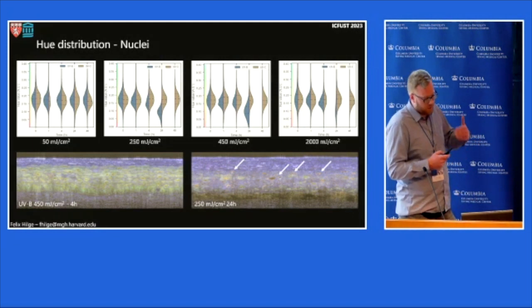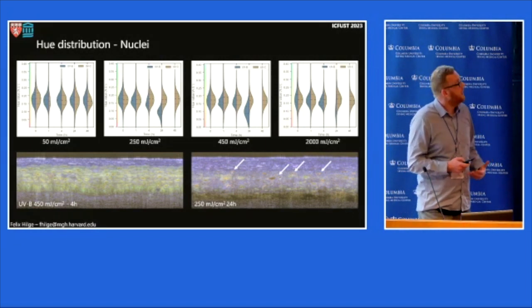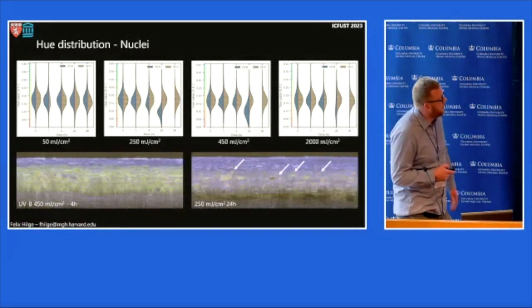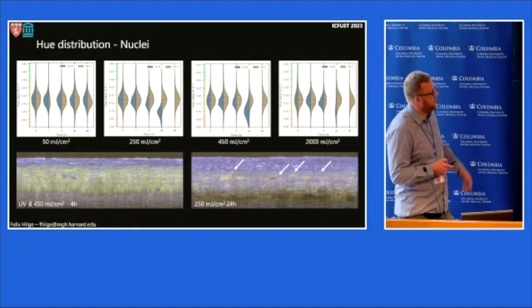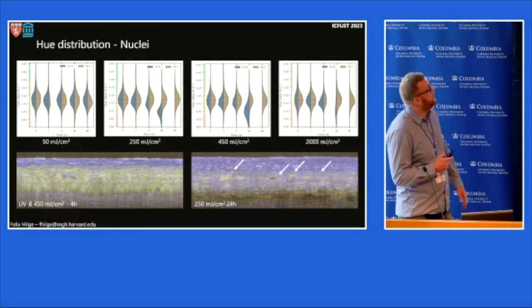Again, red means more subcellular motion. And then after 24 hours, when the cells are dying or about to die, there are only the nuclei left, but there's not much cytosol visible. So this could even be like an apoptotic body. I'm not 100% sure.